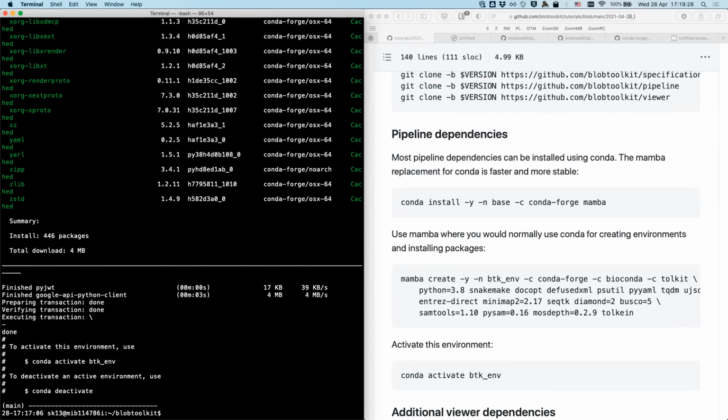But you've started it now. Yeah, it's running now. I mean, you could just let it run in the background and watch, and then do the other steps yourself. Yeah, absolutely. Otherwise, we'll be waiting for, I think, too long.